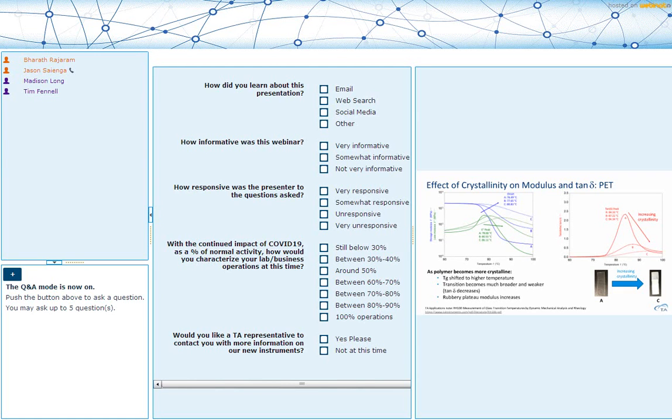So I'd exercise caution in first checking if there's literature to see if TTS is suitable for this material, if there's any published literature. See if the curves shift easily, or if additional or more advanced analysis is required. And again, refer to the body of work that's already published, or TA's application notes on this topic.